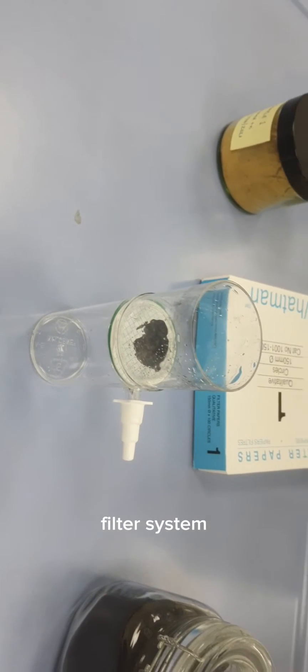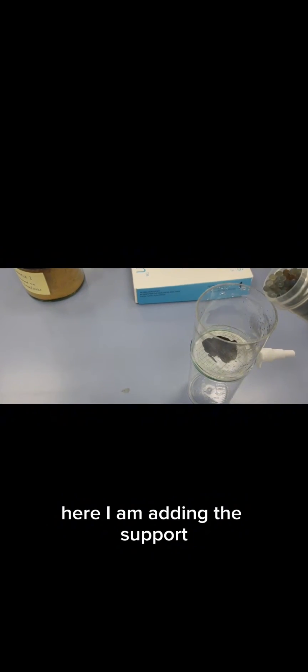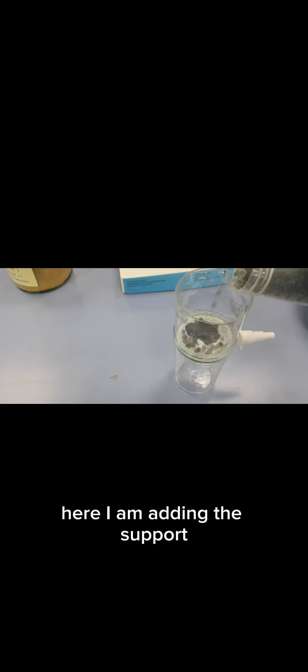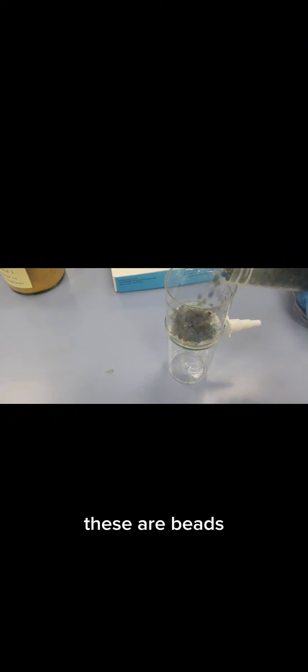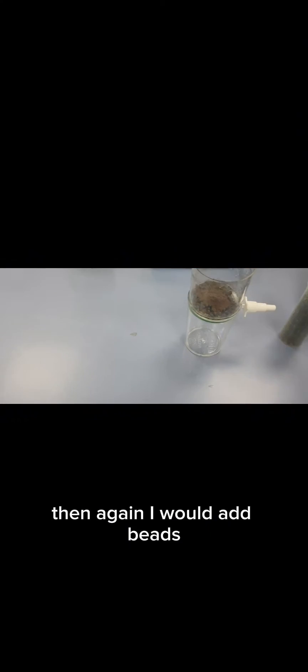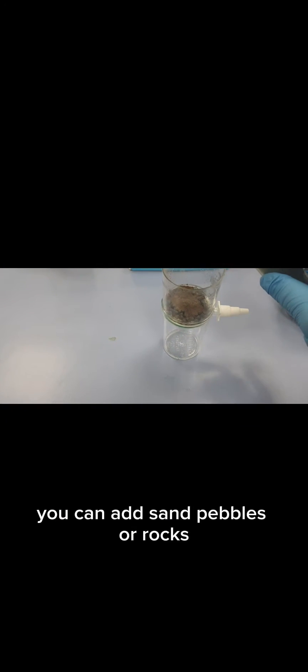Here I am adding the support, these are beads. Now I am adding the pozzolona layer. Then again I would add beads, you can add sand, pebbles, or rocks.